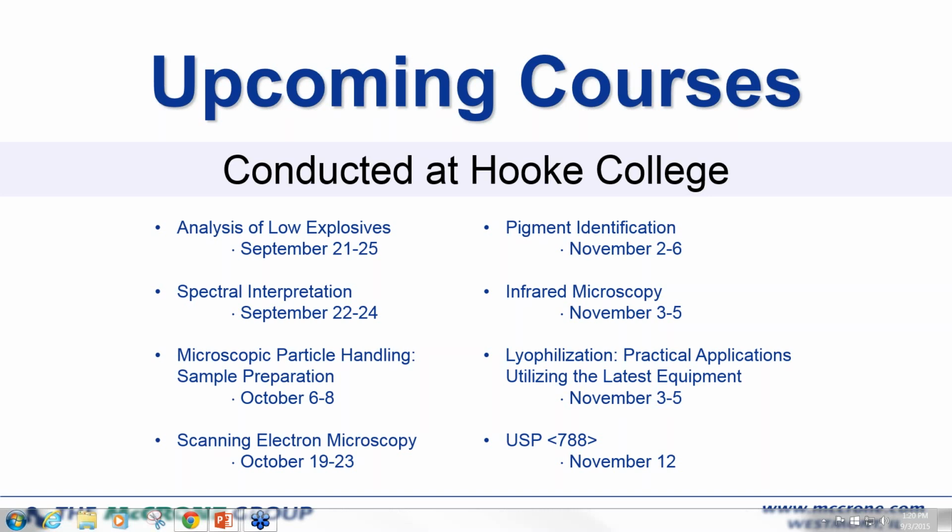It's a good question, because quaternary and tertiary amines do not always give robust IR spectra that lets you identify them as tertiary and quaternary amines. So sometimes you have to use other information you know about the sample. That's one of the reasons we use the stereomicroscope first, is it helps us a lot.